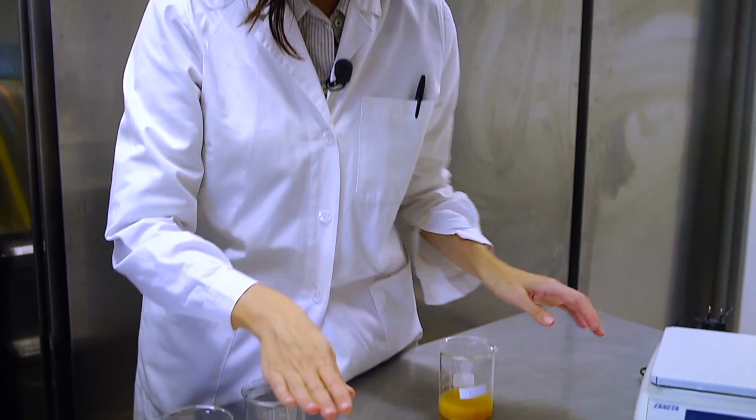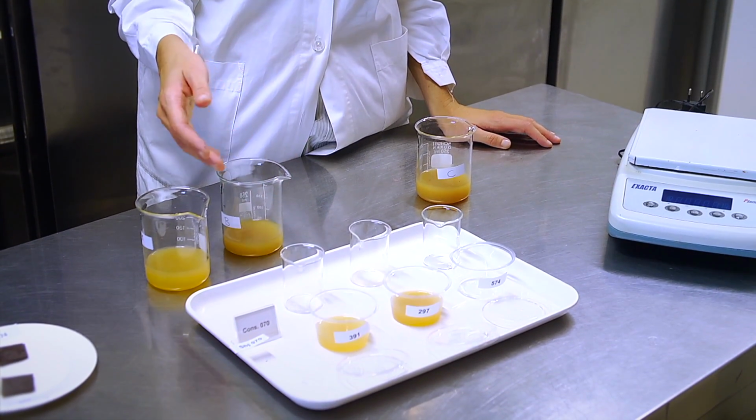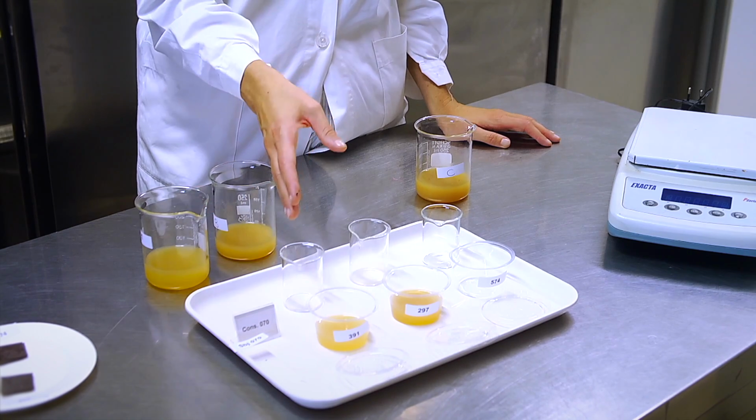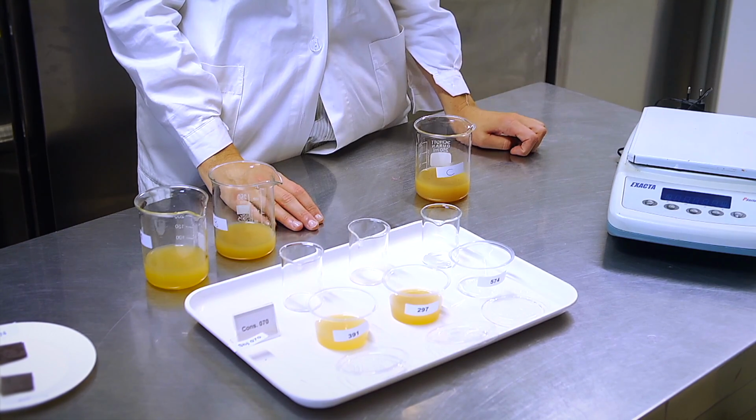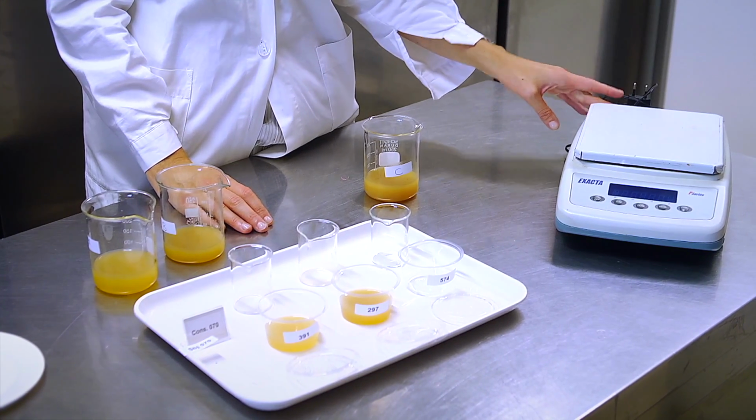So it is important to standardize the served amount of sample, thanks to a cylinder or devices like this machine, the scale. Together with the importance of standardizing the amount of sample served, it is also important to standardize the serving temperature, so the temperature at which a sample is served.